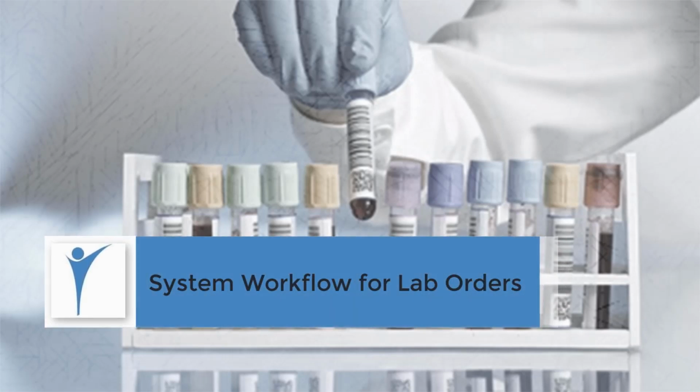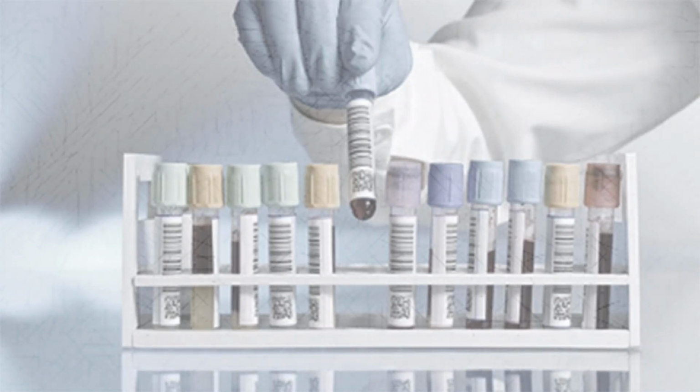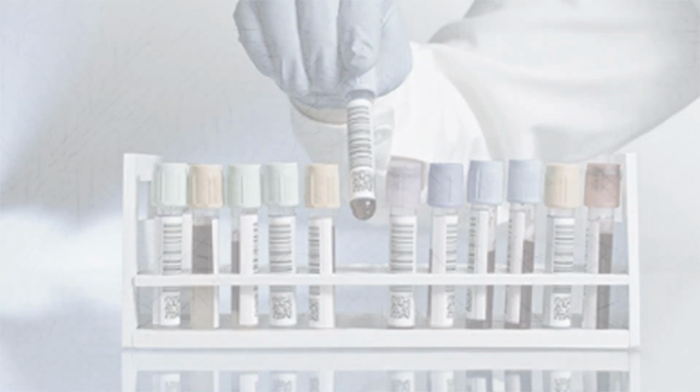Welcome to SoftLab 4.5 System Workflow for Lab Orders. Many diagnosis and treatment decisions are based on laboratory results. Lab test results comprise the majority of the average patient's medical record. The reporting of accurate lab results is imperative for accurate diagnosis and treatment plans.